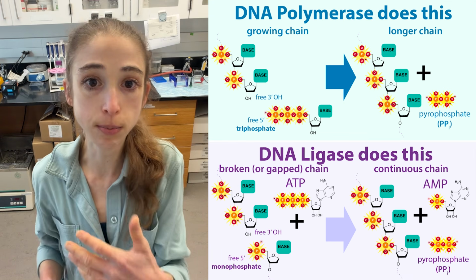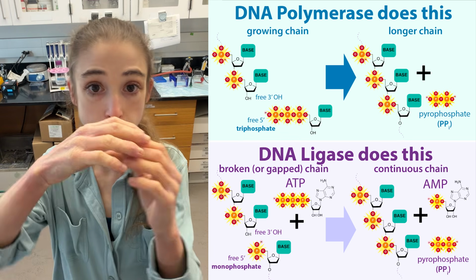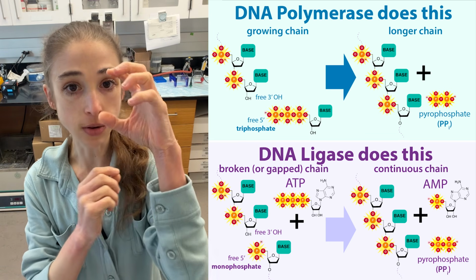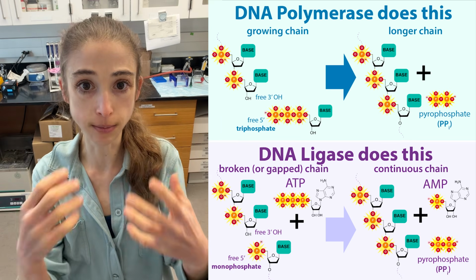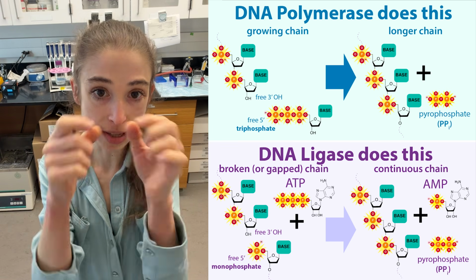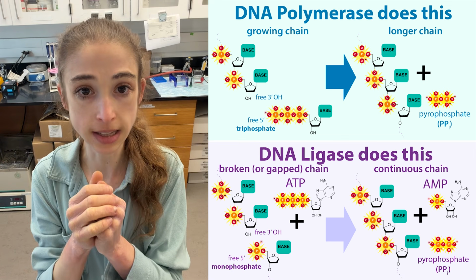And so when we piece DNA letters together, nucleotides, DNA polymerase pieces nucleotides together in the process of making long strands of DNA, and it does this using nucleotide triphosphates. So you have the nucleotide, your DNA letters, with 3 phosphate groups, and the phosphate groups are actually providing the energy that the DNA polymerase needs in order to piece them together, because when you piece them together, you release phosphate groups, and then you get energy that you can use to help power the process.